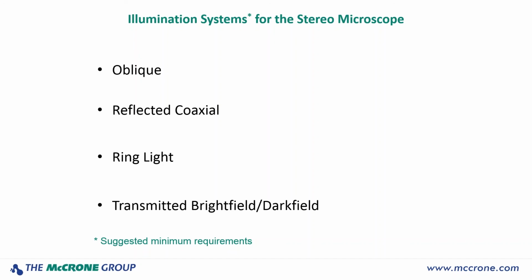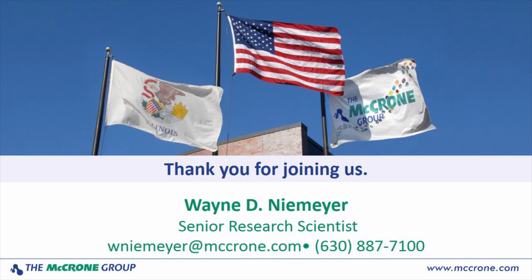Curtis, you said, can you please describe an examination scheme, say, for a visually smooth surface? What would be the sequence of lighting conditions for the exam? Would you use all lighting conditions for all sample types or certain ones for general categories of items? My typical answer to that is I'd use everything I have. But generally for a smooth surface, I would look first of all with the coaxial illumination. That really highlights the features on the surfaces with the stereo microscope.